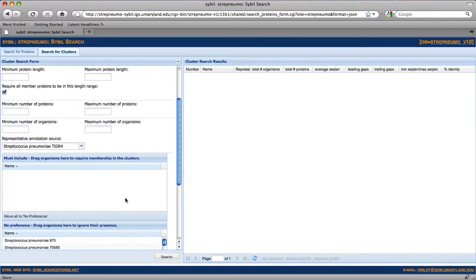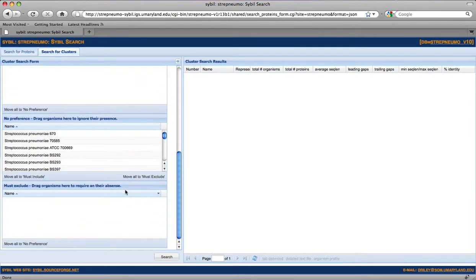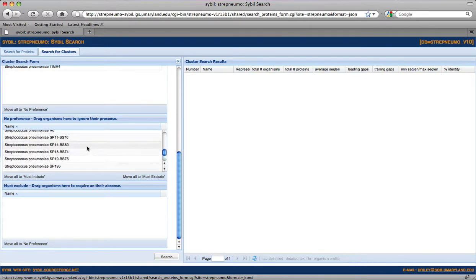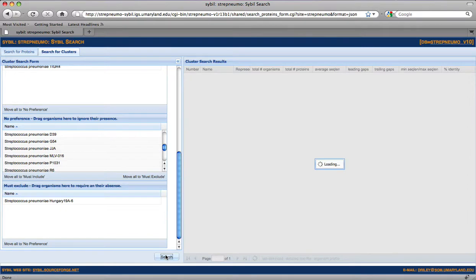And I'm going to ask for only clusters that include Tiger4, and do not include Hungary 19A-6. Now I'll click Search.